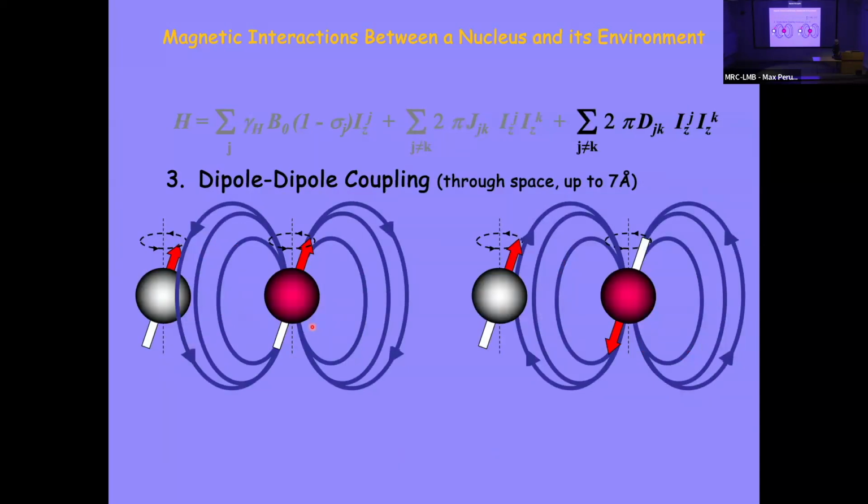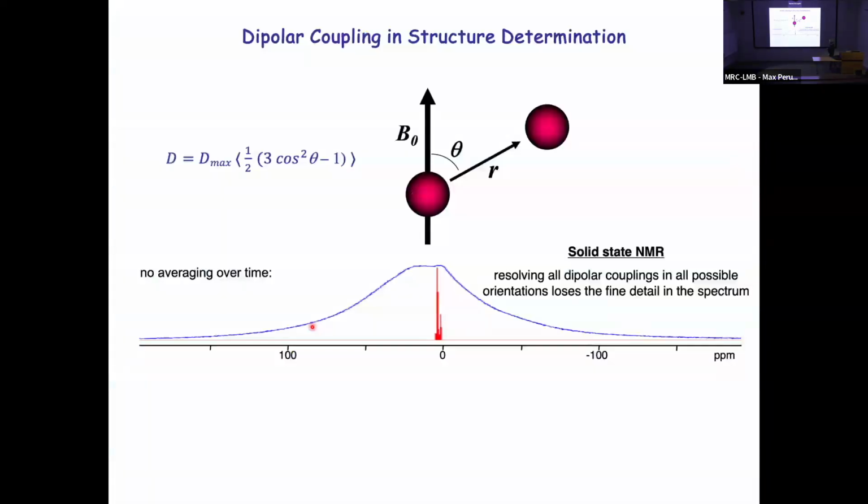influence on the spectrum is perhaps more intuitive, and it is the direct influence of nuclear dipoles. So if you've got a spin and it's close in space to a neighboring spin, you can see the effect of the neighboring spin being either in the aligned or anti-aligned orientation. And so we get these two different states. So in fact, the separation of these two spins, these two lines, is the summation of the J and the dipolar coupling. Okay, so let's look at what that means in practice.